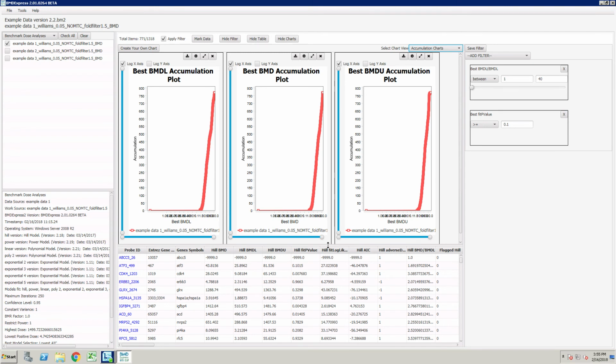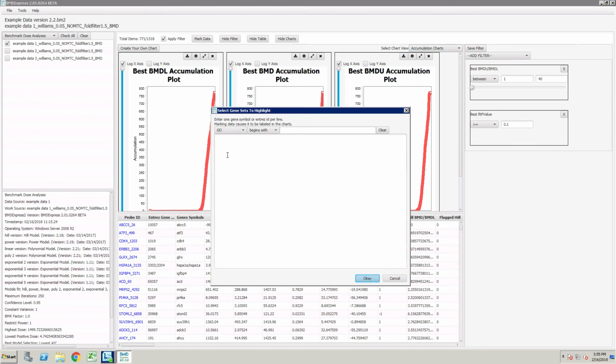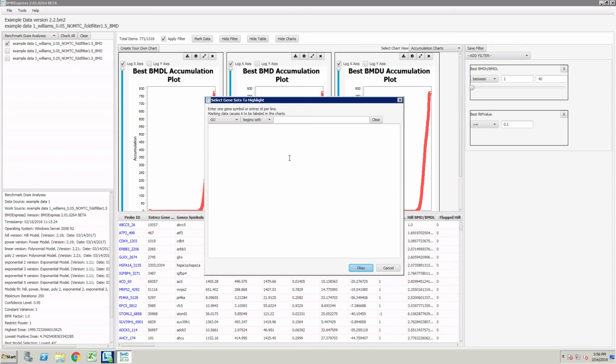And one of the nice features here that I will just highlight real quickly is we have a mark your data function. And so as you recall from the update, what we pull down is GO terms and Reactome annotations for all the genes. And so what you can do is you can say, okay, show me the genes. In this case, I went to mark my data. I can do xenobiotic catabolism, and there's a couple of genes there.